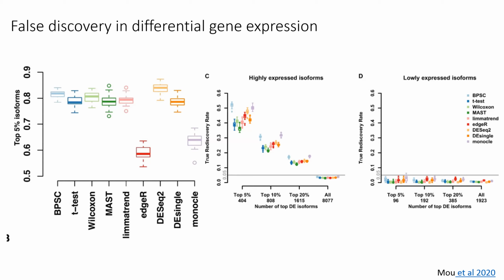However, to do this, you need to make many strong assumptions about the distributions you're working with. And as I've said before, this is very difficult to do in practice because of the diversity of cell types within samples and the unknown distributions of genes within them. To summarize, there's lots of practical issues in trying to regress out batch effects, given the number of genes and it being a more parametric approach.